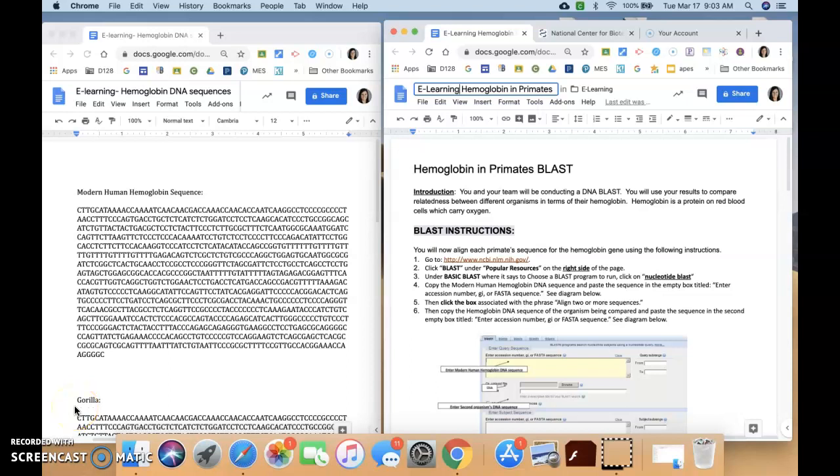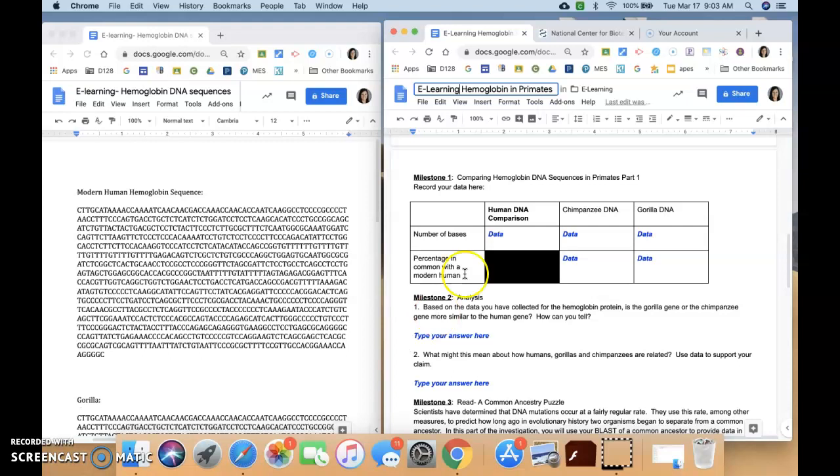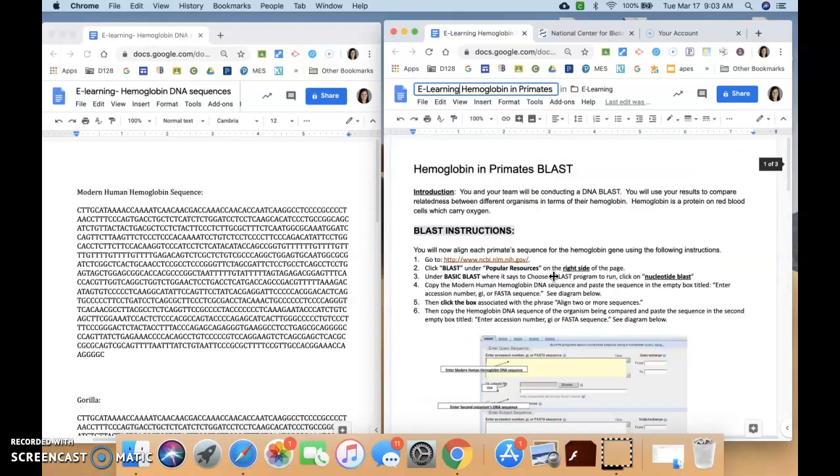Good morning. Today you're going to be doing an e-learning hemoglobin in primates lab. What we're going to do is take a look at DNA between different types of primates. We're going to compare human DNA with chimpanzees as well as gorillas and look at the relationship between them. So you're going to use that BLAST program that you've done in the past.